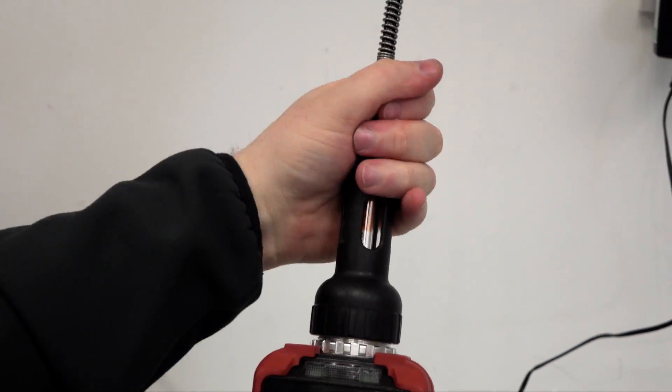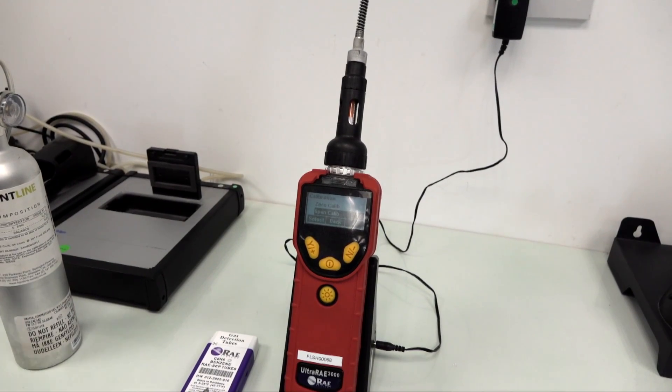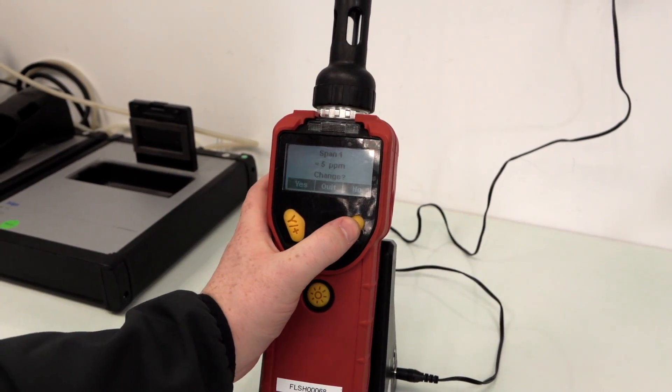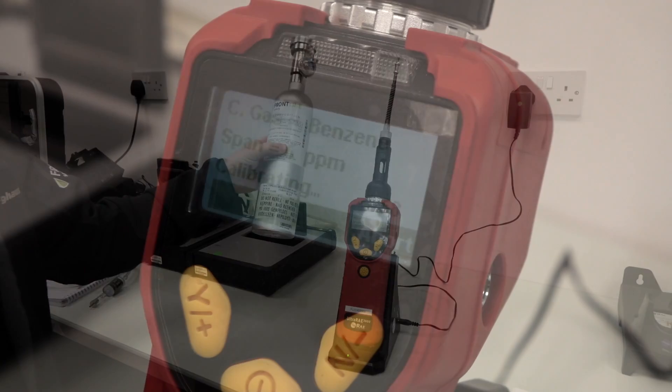The gas separation tube filters out any unwanted gases, allowing the target gas to be accurately measured. It's important at this point to properly refit the probe, making sure it's tightened. Now attach the calibration tubing to the probe.